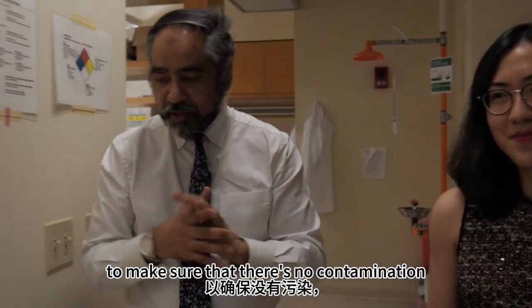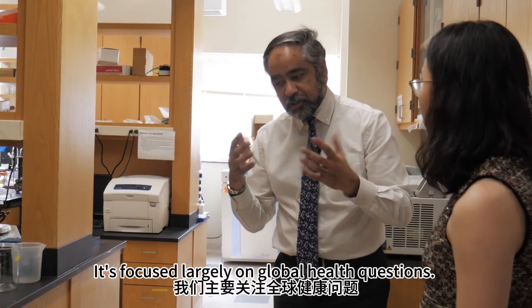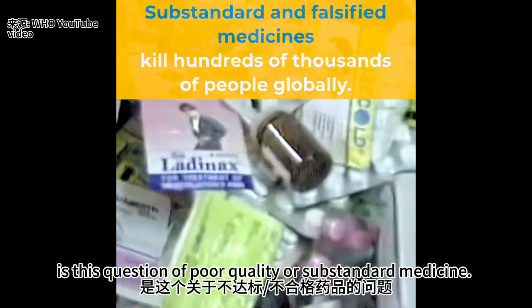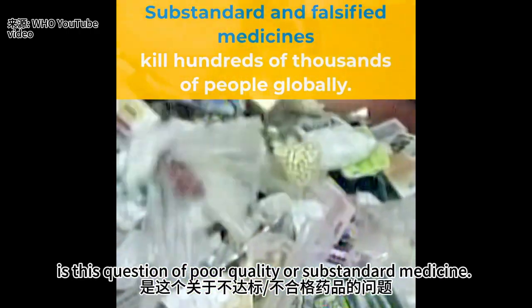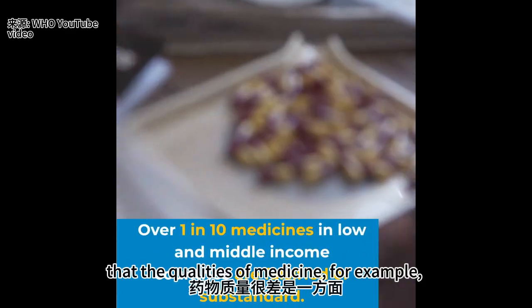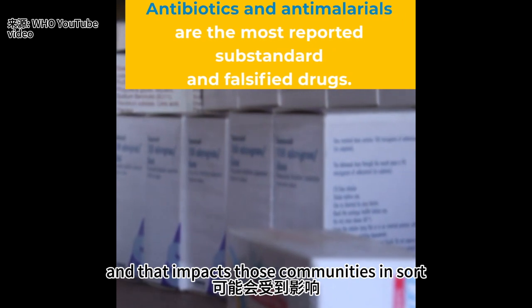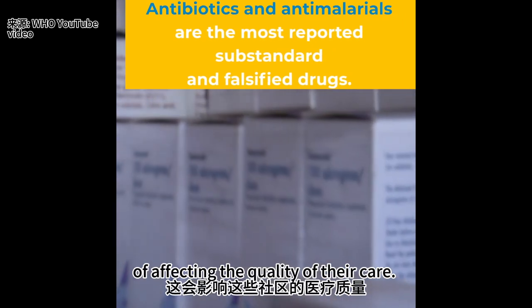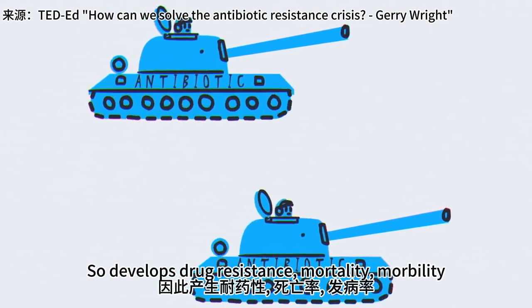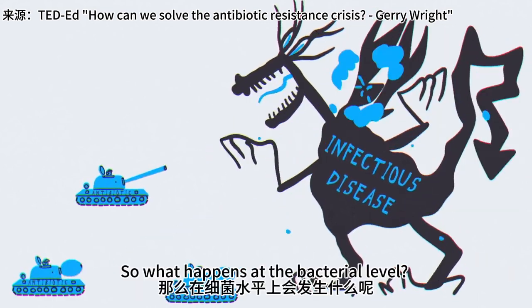So the other part of the lab, which is separated a little bit to make sure that there's no contamination because we work with bacterial systems there, is focused largely on global health questions. One of the things that we are very interested in is this question of poor quality or substandard medicine. One of the things that you would see in low and middle income countries is that the quality of medicine, for example, antibiotics, antimalarials, may be compromised. And that impacts those communities, affecting the quality of their care. So it develops drug resistance, of course, mortality and morbidity, financial loss. So we are very interested in understanding the biology of that question. So what happens at the bacterial level?